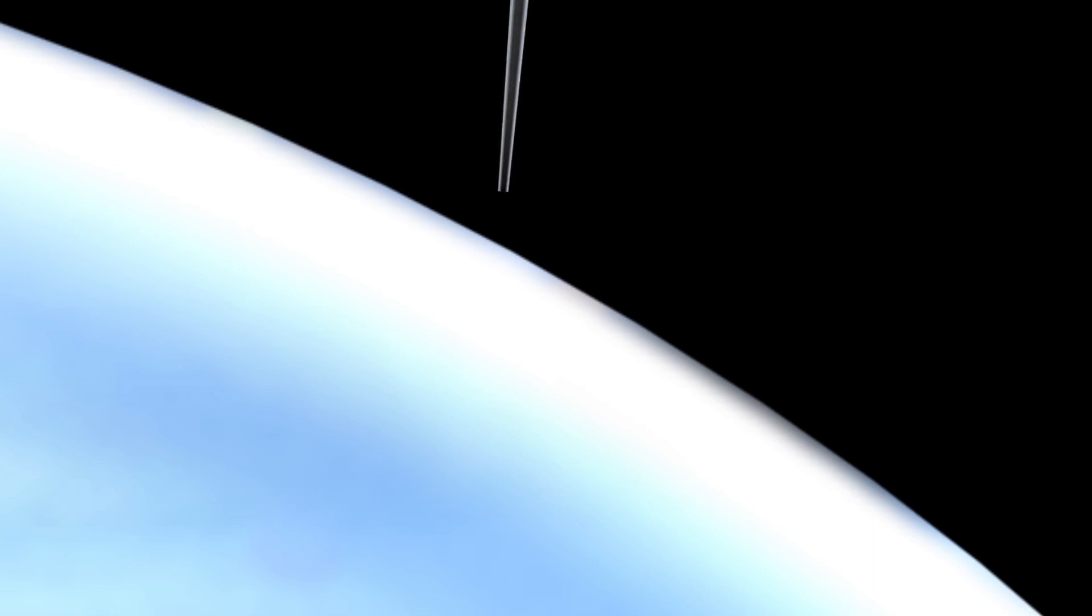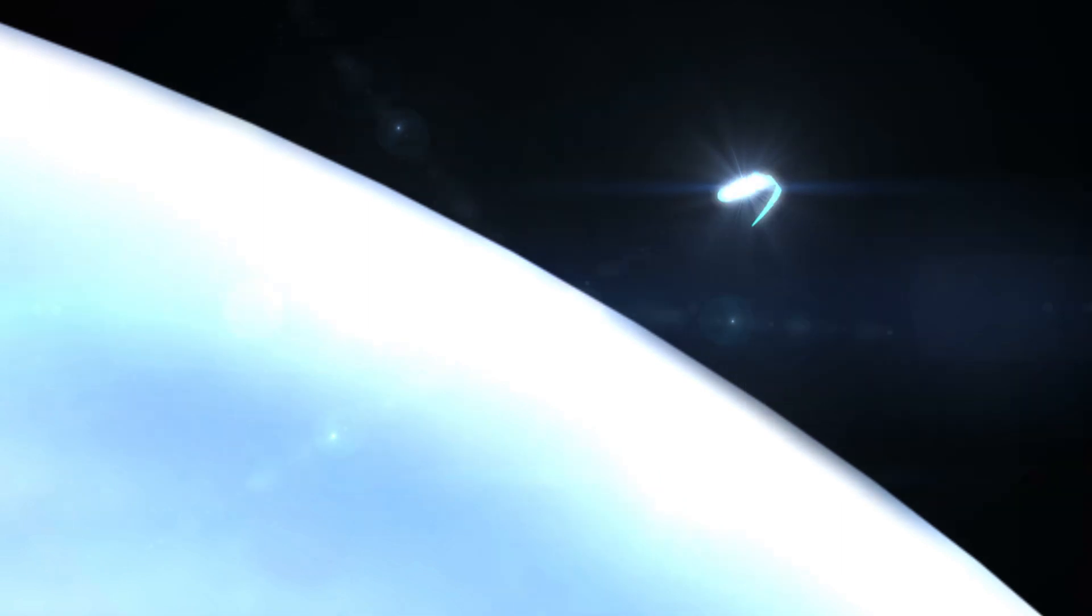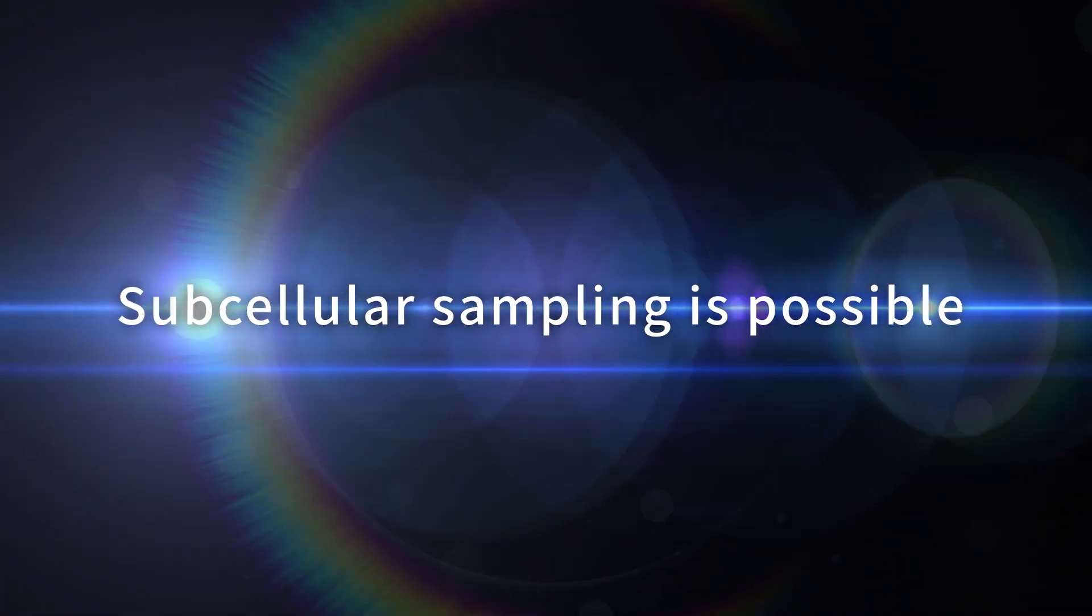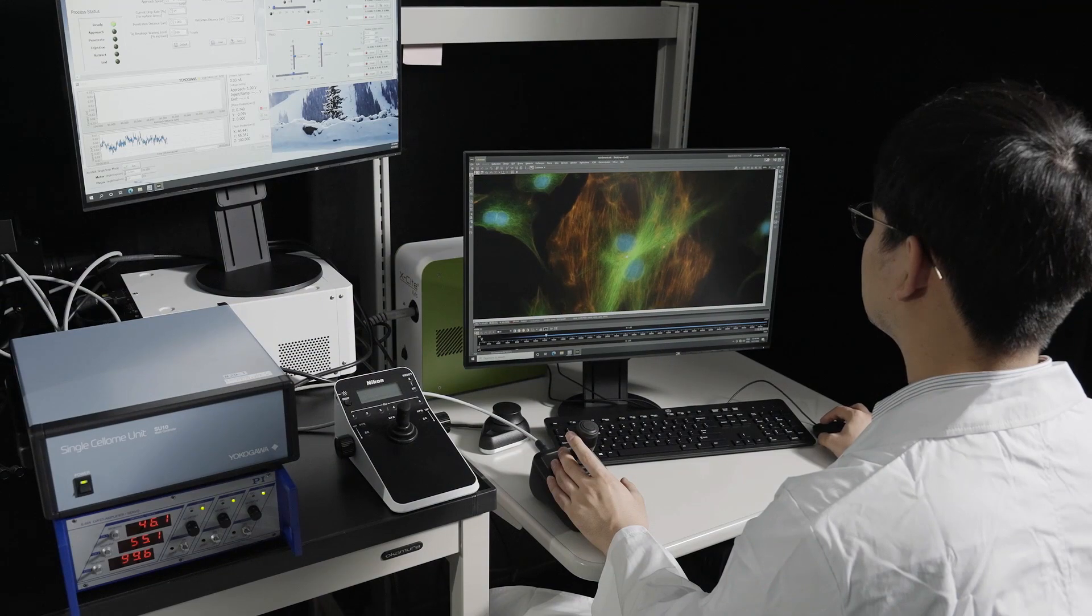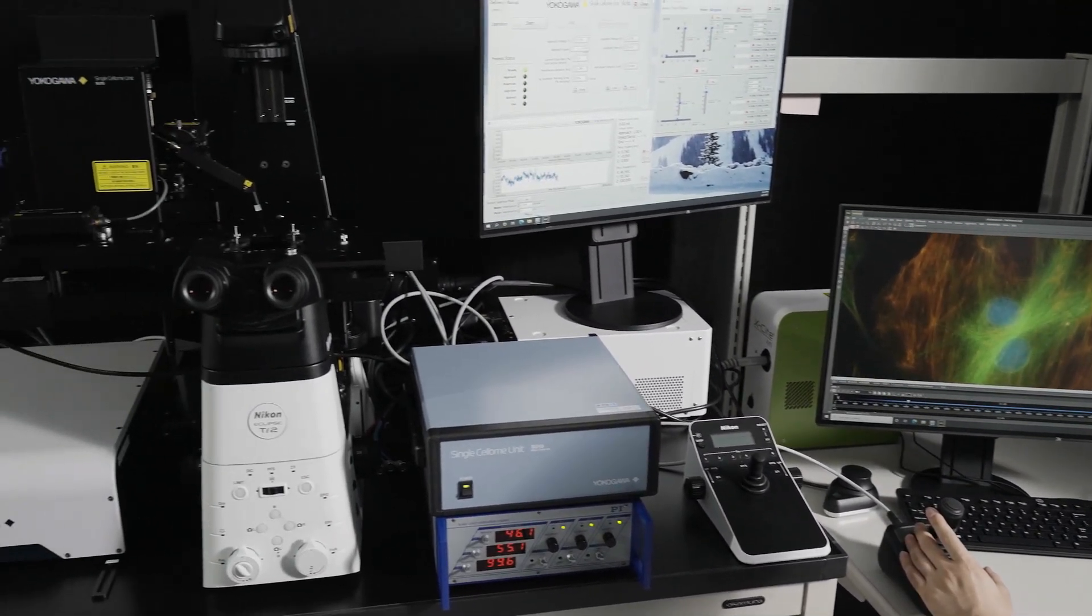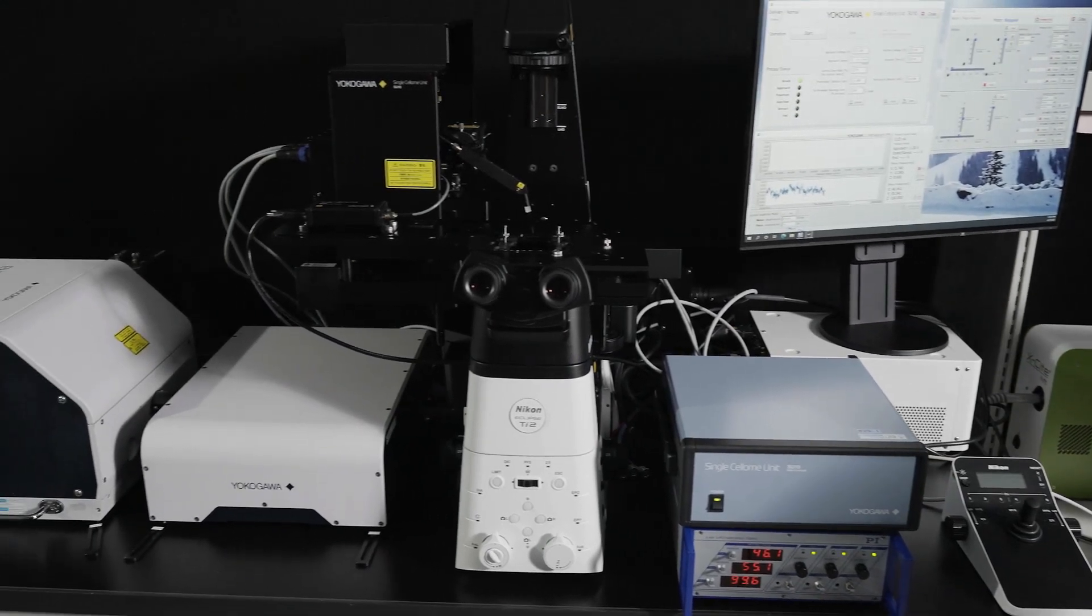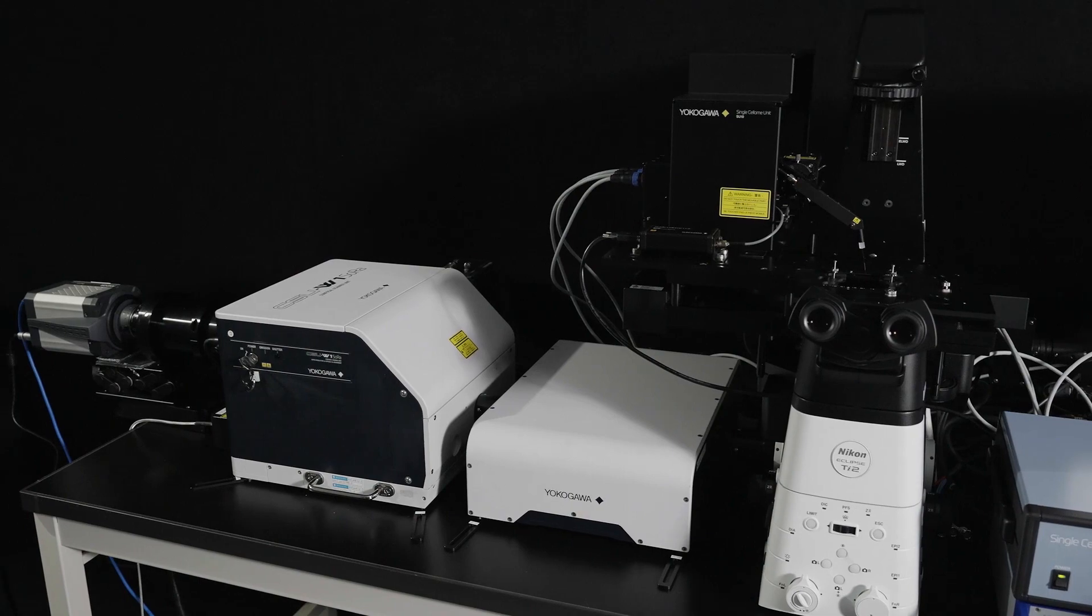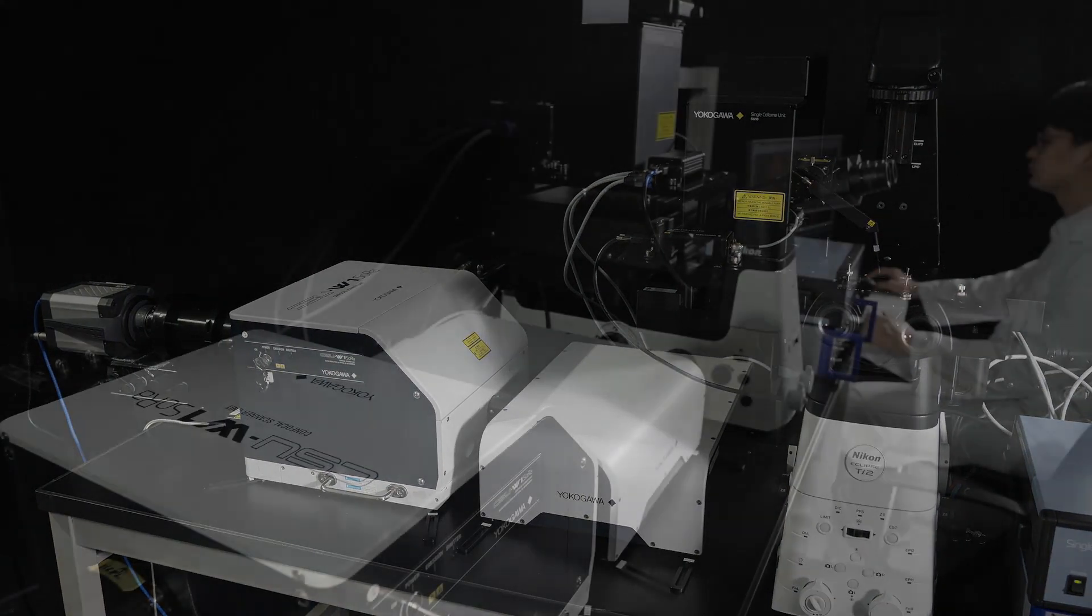Go beyond simple observation of your cells. You can manipulate even challenging cell types that are resistant to existing methods for intracellular delivery or sampling. Let the SU-10 be a partner to take your research to the next level.